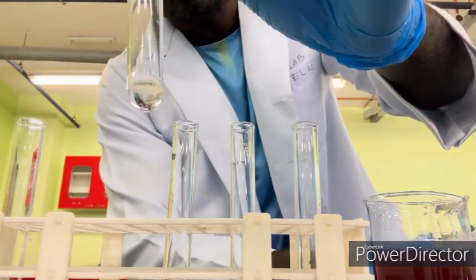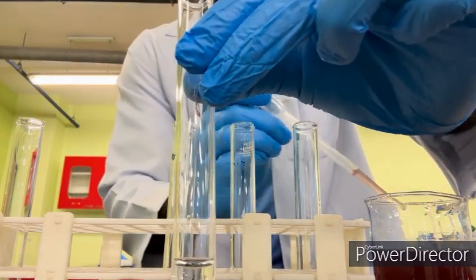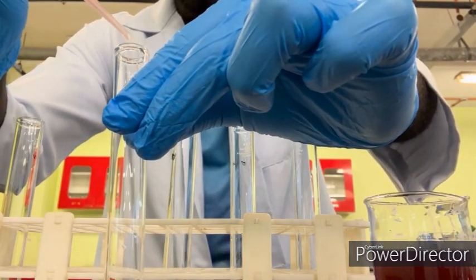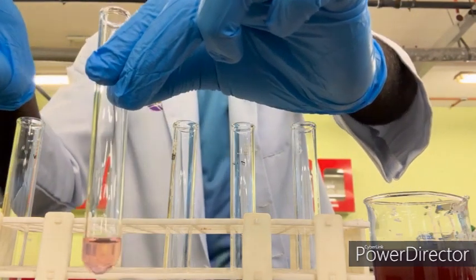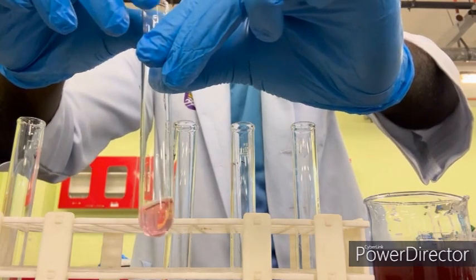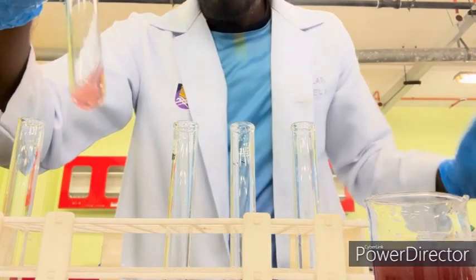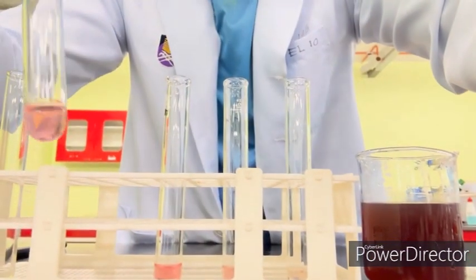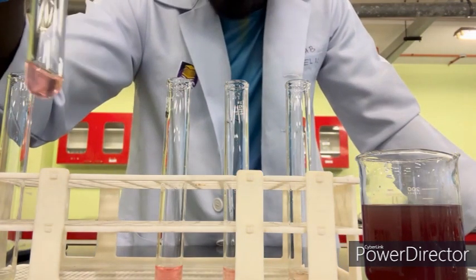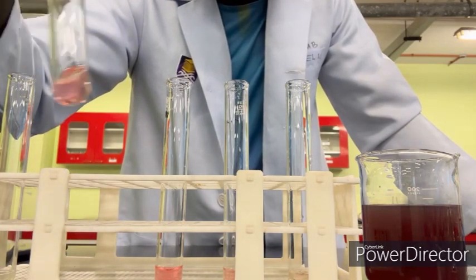Okay, and this one is 1 M acetic acid. I'm going to add a few drops of our solution. And these are the color changes for the 1 M acetic acid once we added the solution.